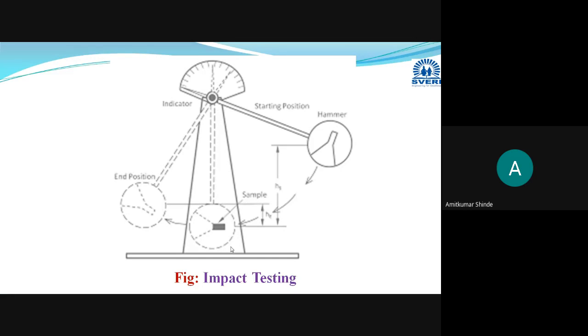The process is almost similar in both testing methods. Just the arrangement of the specimen is different, or there is a slight change in the specimen fixation method. Please draw this diagram. I will give some time here, wait for a few minutes. After that, I will start the procedure, and we will discuss its output.